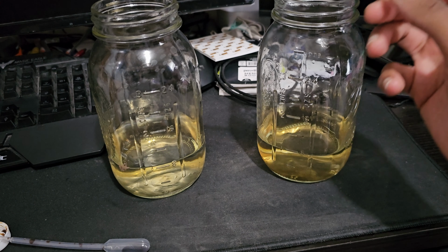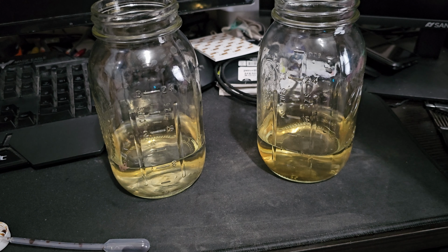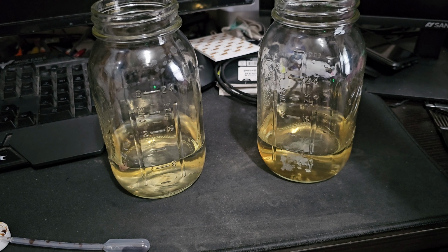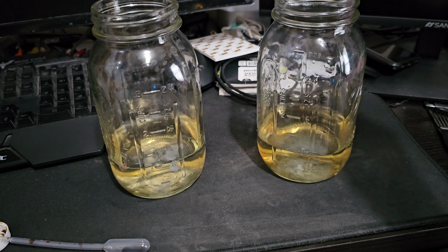Like I said, it's some milk that I've been meaning to throw away. It's not good or fresh milk. It kind of smells. So I'll add a little drop of it. I'm sure it's full of milk bacteria and probably lard. It's about 3 drops maybe. Let's do 3 in there. One more maybe. There we go. That should be good.